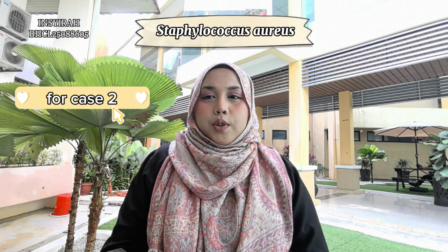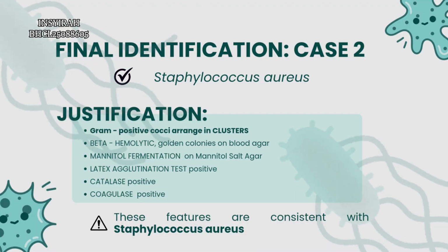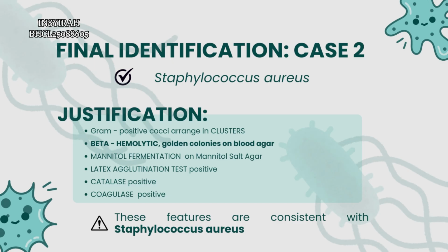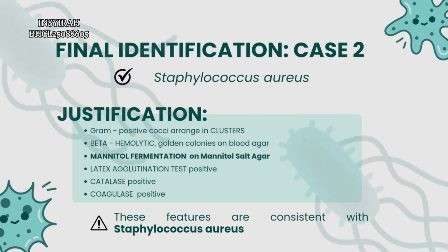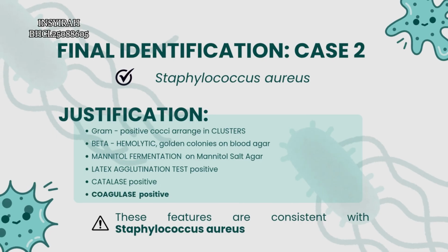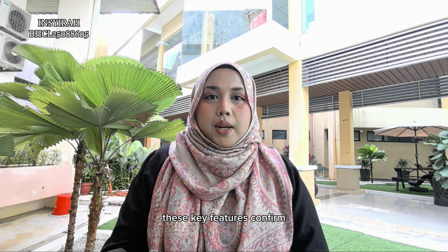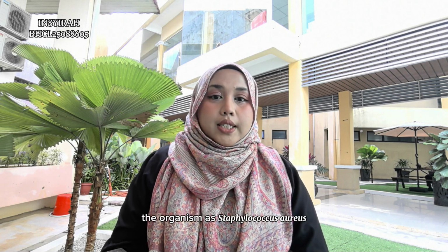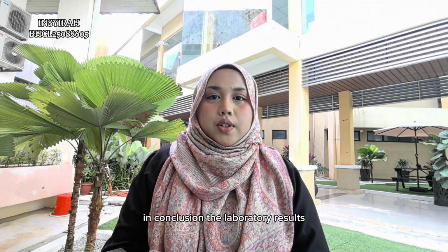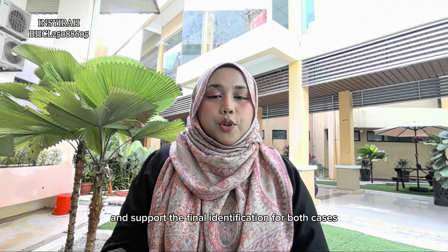For case 2, the organism was identified as Staphylococcus aureus. The Gram stain also showed gram-positive cocci in clusters. However, on blood agar, the colonies were golden and beta-hemolytic. On MSA, the organism fermented mannitol, causing a color change. The bacteria was catalase positive and coagulase positive. The latex agglutination test was positive. These key features confirm the organism as Staphylococcus aureus. In conclusion, the laboratory results clearly differentiate the two organisms and support the final identification for both cases.